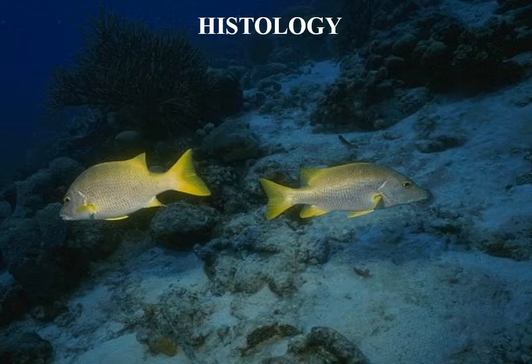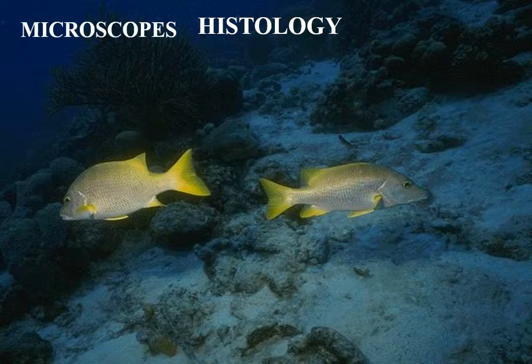Histology is the science that deals with the microscopical study of normal tissues. Histo means tissue and logia means study. Microscopes. There are several types of microscopes available for histological study.